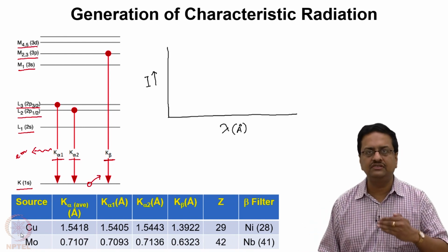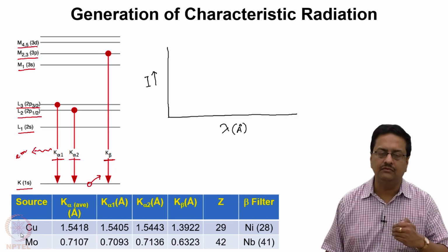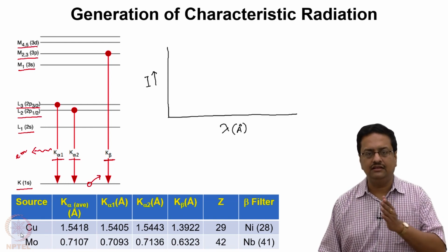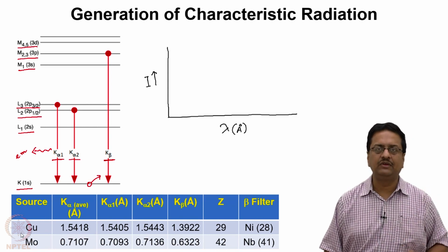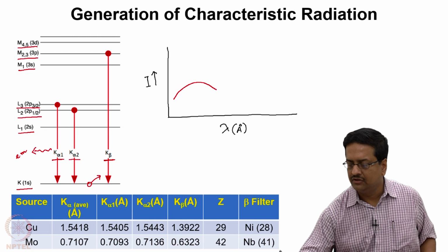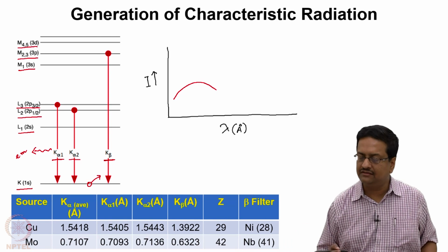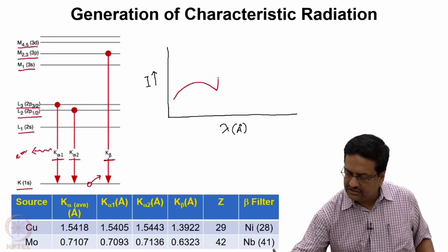But when they are approaching the anode, they feel a deceleration. As a result, the electrons are decelerated, the velocity is reduced, and in that process, the charged particle, when it is decelerated, continuously emits some X-ray radiation, and that region looks like this, which emits white X-rays over a range of wavelengths, and then at a given point we see a radiation peak.